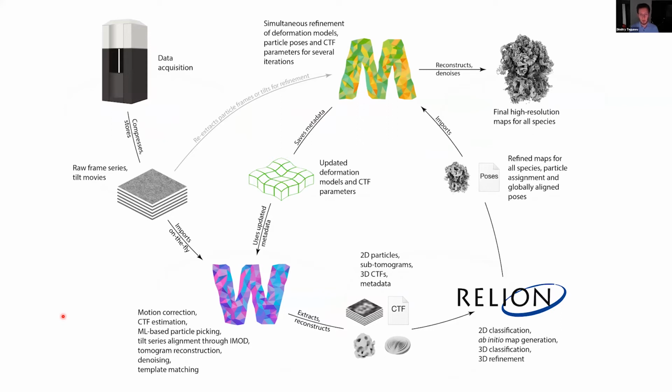And this is how it fits into the entire processing pipeline. So data come out of the microscope, either tilt series or frame series. And during this talk, I'm going to refer to what is commonly referred to as single particle data as frame series, because I find it rather unfortunate to reserve single particle just for 2D data. It's still single particle analysis if it's tilt series. And then those data go into Warp, which some of you are already familiar with.